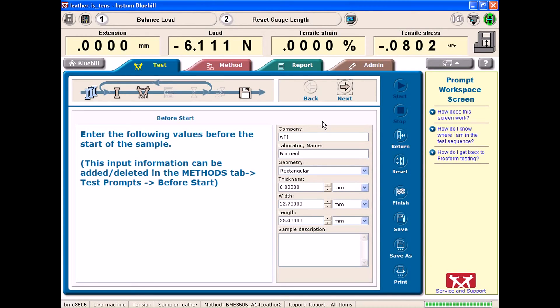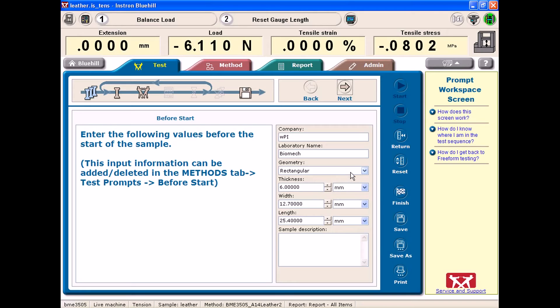And this is where you wanted to enter in your specific parameters for your test, you could do so. But let's just imagine for the sake of this example video that we already ran our test.